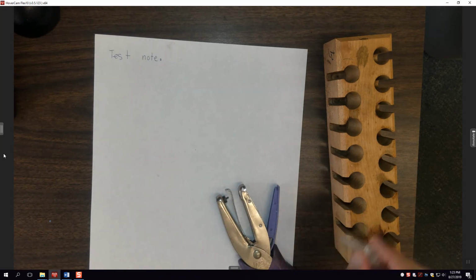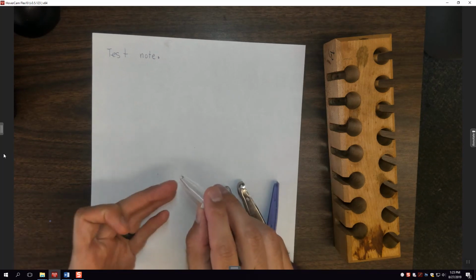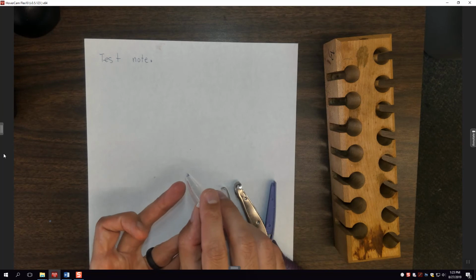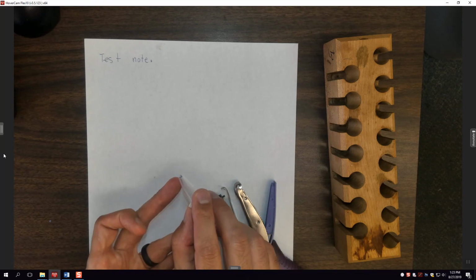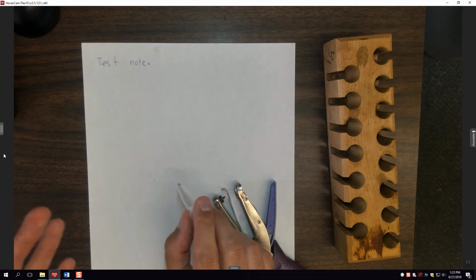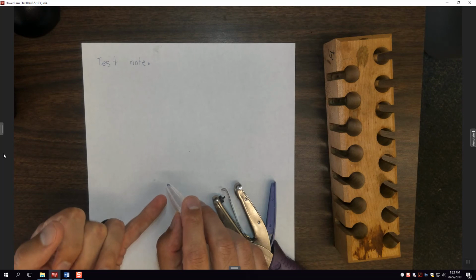What I'm checking is that my pyridine becomes blue. I'm not going to do this because I'm in my office, I'm not in the hood. You're going to add the pyridine in the hood. I'm going to check to make sure the pyridine turns the color of the ink, or at least a color. It may not be the exact same color. It might be a lighter shade of blue or something. But I'm going to make sure that the ink is dissolved into the pyridine.